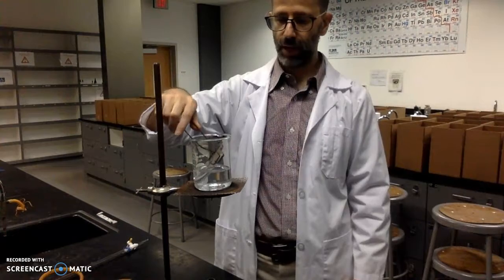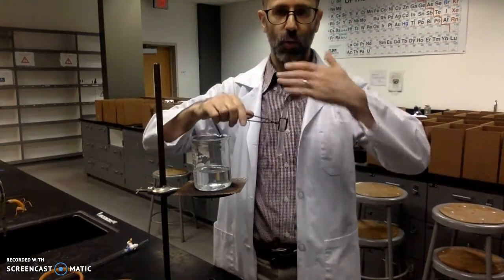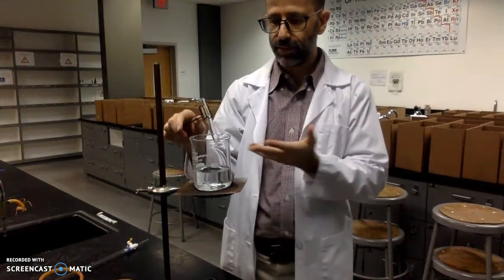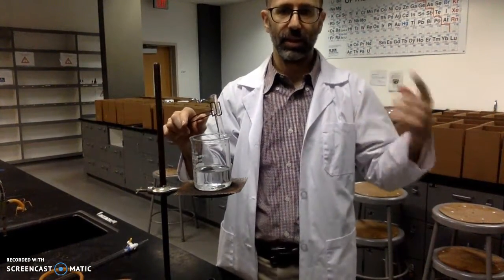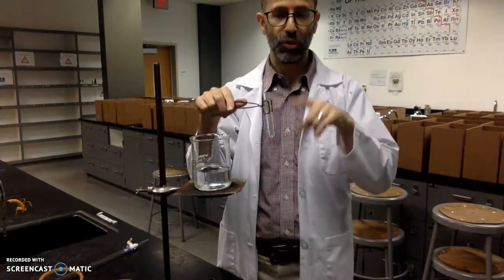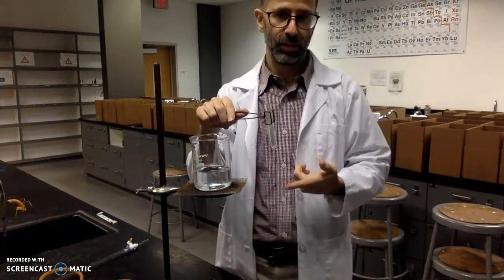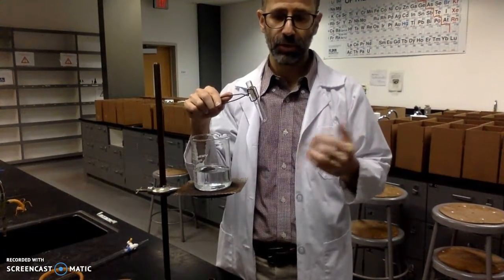After about a minute of it heating up, you could waft it again and see if you can smell anything or observe anything. If nothing happens, as a last step, you could reverse the order that you added them. For example, if you added silver nitrate first and then the other substance, try adding the other substance first and then the silver nitrate and see if that makes a difference. Sometimes that might make a difference.